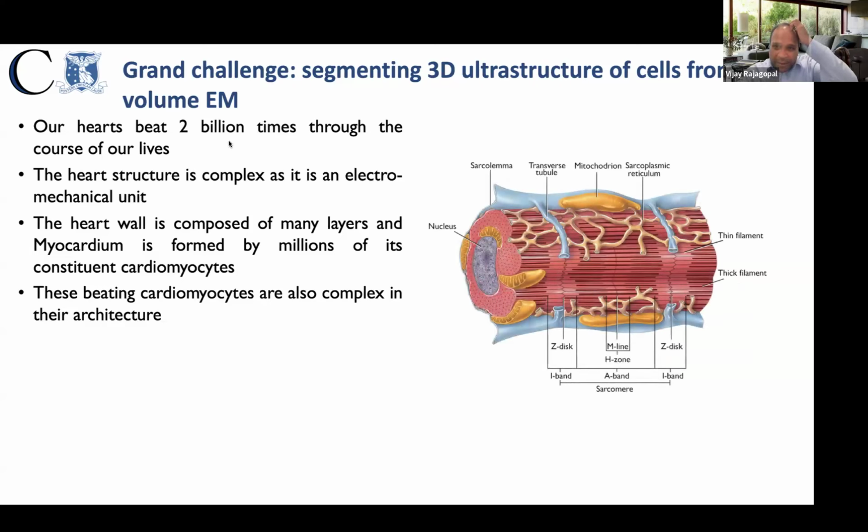So we're going to talk about muscle cells, and this is the typical image of what a muscle cell looks like. You've got your cell nucleus, you've got your T tubules. They're the invaginations of the cell membrane that activate the muscle cell's contraction, excitation-contraction coupling. And you've got mitochondria to produce energy, and then your myofibrils.